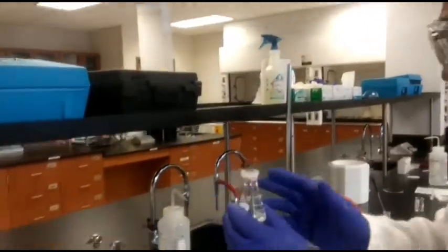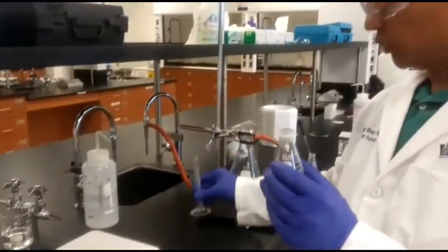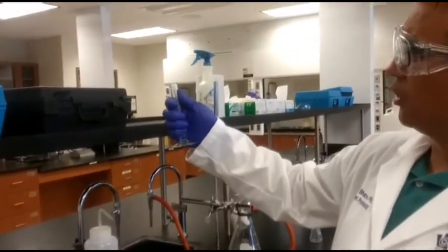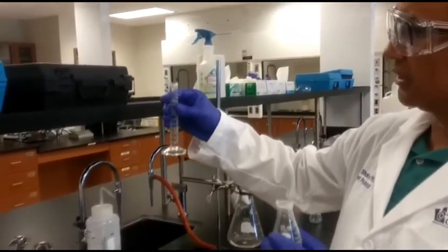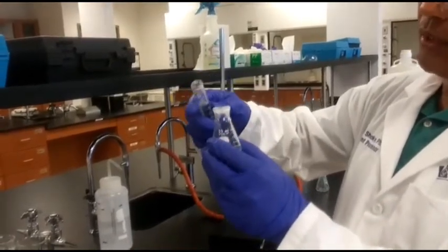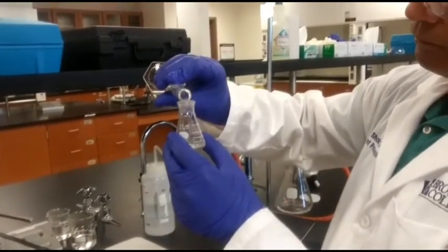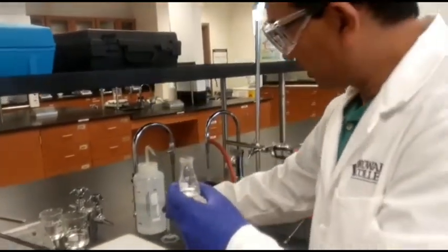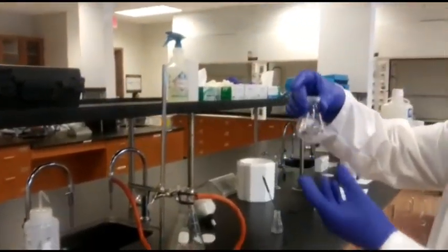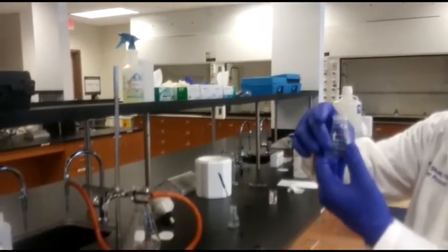Alright, now we need to recrystallize this by using water as the co-solvent here. So I have here hot water heated to about 55 degrees Celsius. This is 10 milliliter of hot water. That is what I will be using on this one, and I will add this water here. Okay, so this is with water. Now we let it sit for 10 to 15 minutes. That is when all the acetylsalicylic acid will crystallize out from there.